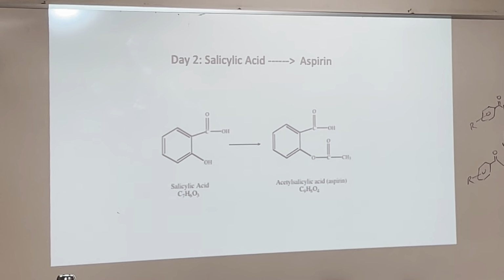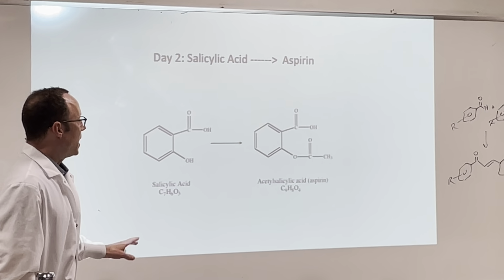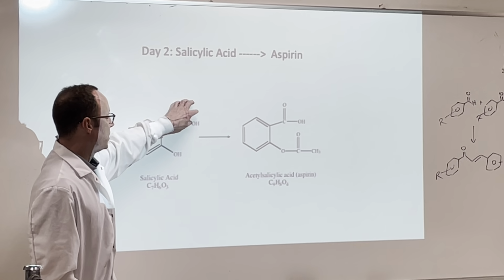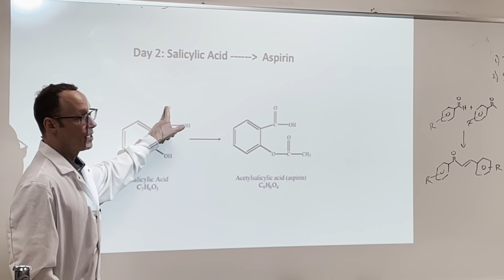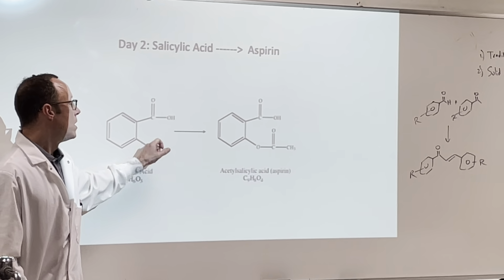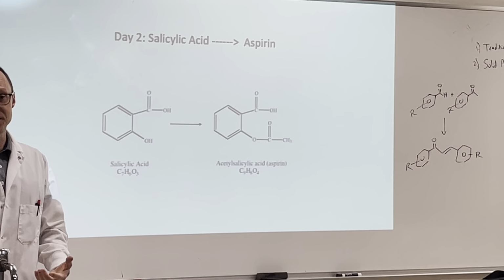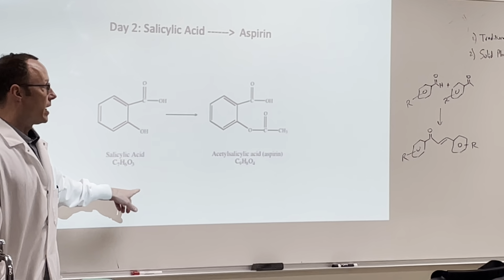So basically what we're going to be doing is, we hydrolyzed the ester originally, right? There used to be the methyl ester here. So we hydrolyzed that in the first half of the synthesis. The second half of the synthesis, we're putting on an ester again. It's just not at the same place.